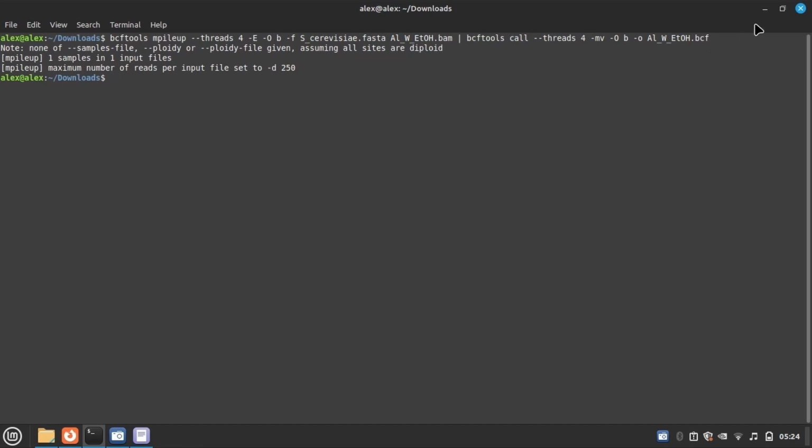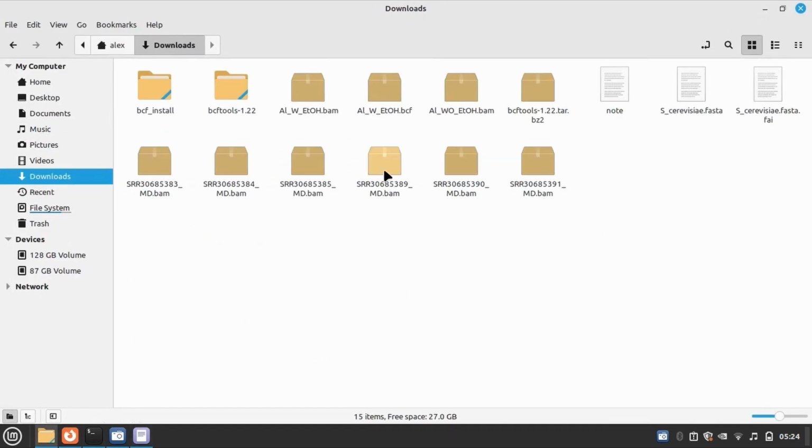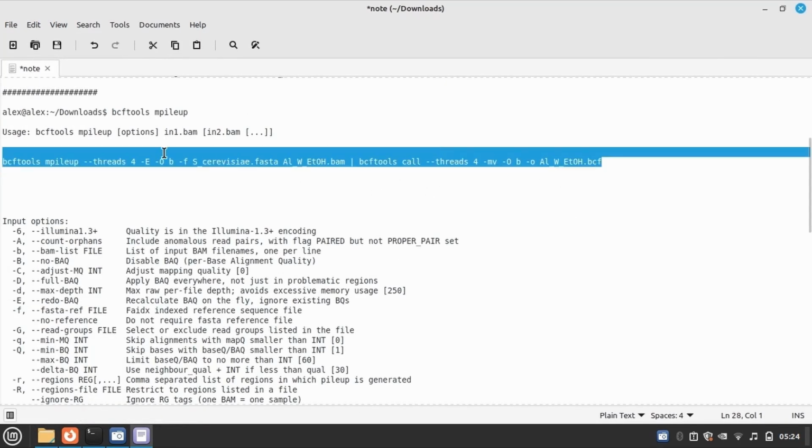Okay, it is done. Let's check it. Here you can see the BCF file of this input file. Let's do it for the second sample.